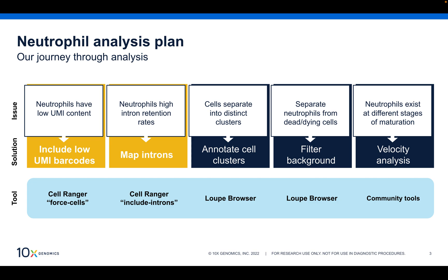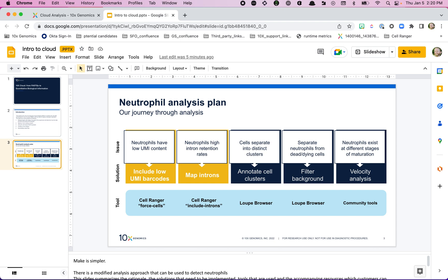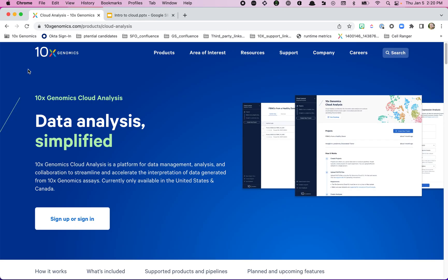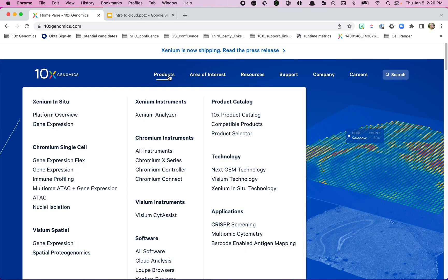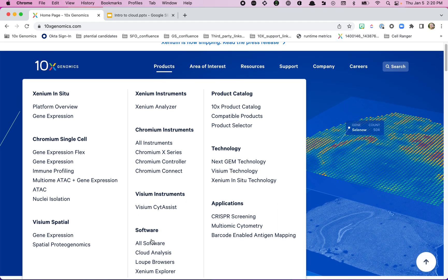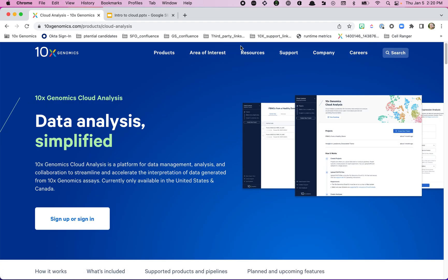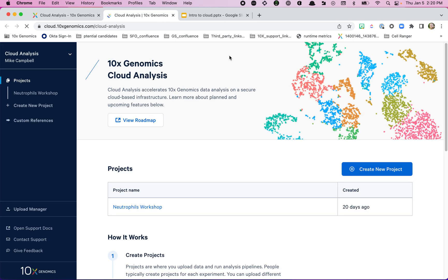Now I'm going to jump over to the website. Here is the 10x Genomics website — if you go into Products under Software you can find Cloud Analysis. We go into Cloud Analysis and this is the splash page for it: 'Data Analysis Simplified.' We're going to sign up or sign in.